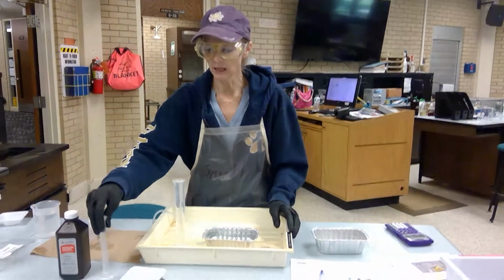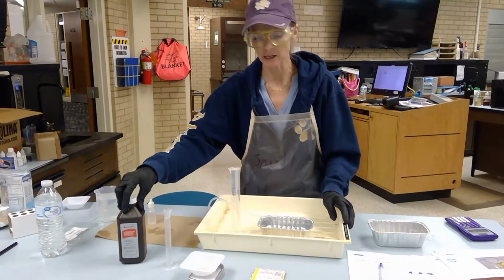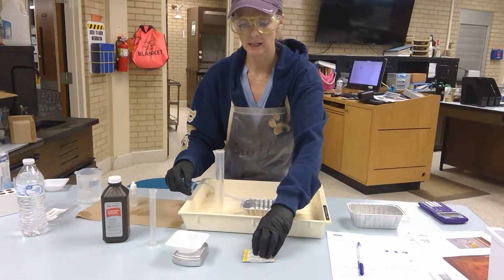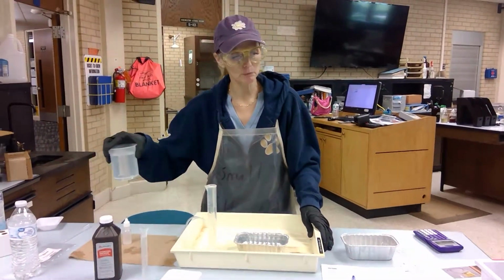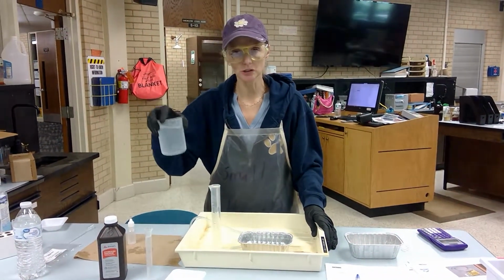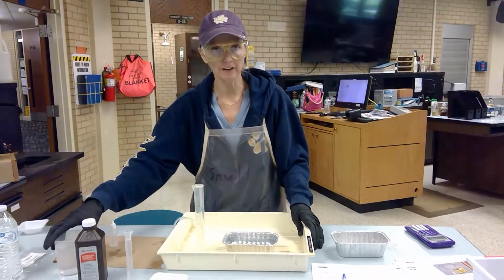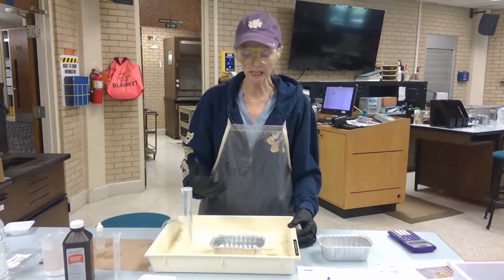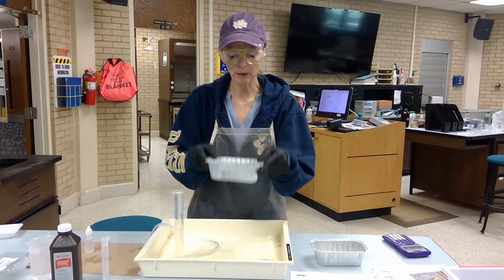In the 10 mL, I've filled it with 3% hydrogen peroxide. I've already pre-weighed out my yeast. In the activity, they ask you to use the graduated beaker here, and I found that it's not as conducive, so I am changing this to a disposable cake pan.